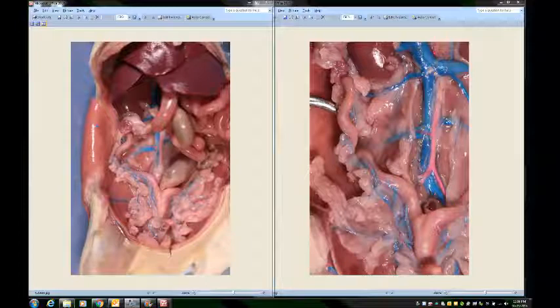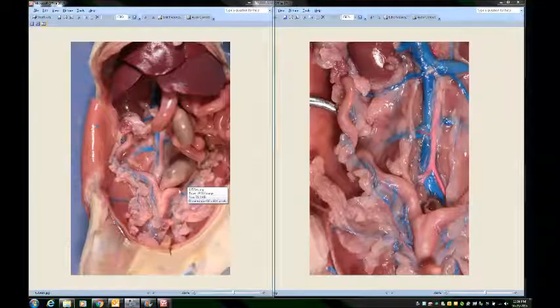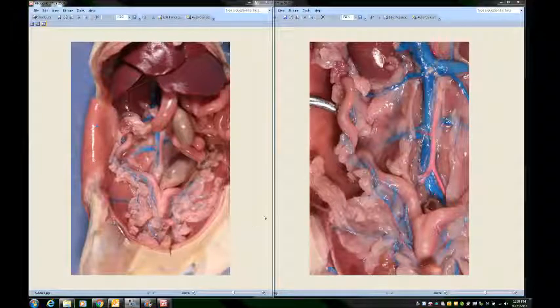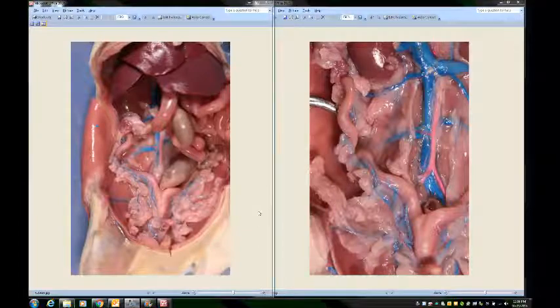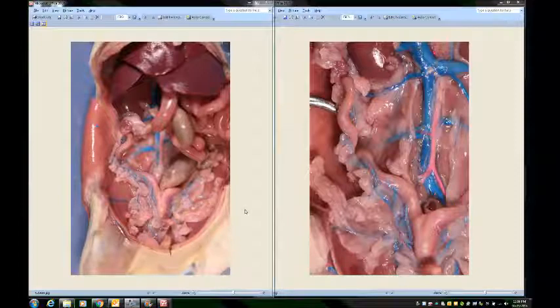Now we'll look at the female rat's reproductive system. In both of these images the rats are non-pregnant females. You can tell because of this long V-shaped organ — which you can see more clearly on one side — called the uterine horn. A rat's uterus is shaped like a long V because rats have multiple births, not just one pup but multiple. Most often the rats will not be pregnant and will look like this. Many students confuse the uterine horn for fallopian tubes because they think of the human reproductive system.